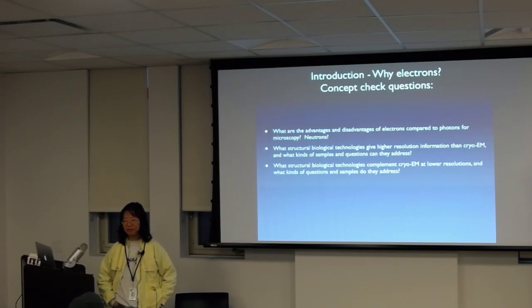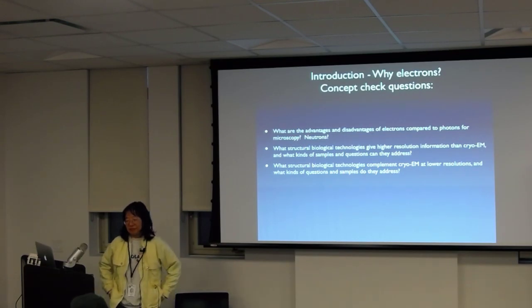You get massive amounts of photons, and you have to basically shoot a whole bunch of small microcrystals. Instead of shooting one crystal and turning it through the X-rays, you're just shooting a whole smattering of small microcrystal samples.